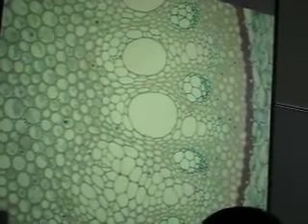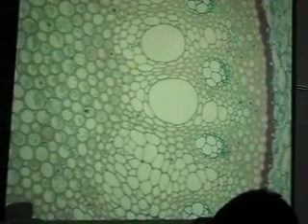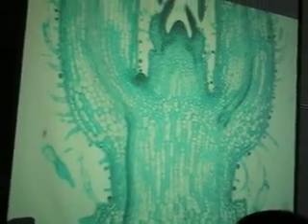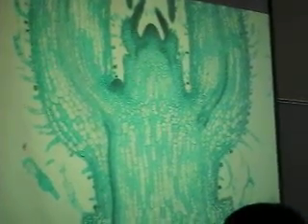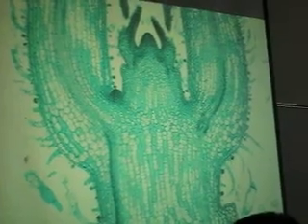Smilax is a vine, carrion flower, and they call it a sclerenchymatous pith. Well, what is sclerenchyma? It's got lignin in it, so it stains red. A little unusual. Most pith is not like that. I don't have any slides for number 5, the tilia root. That's a nice woody root. Take a quickie look at it.